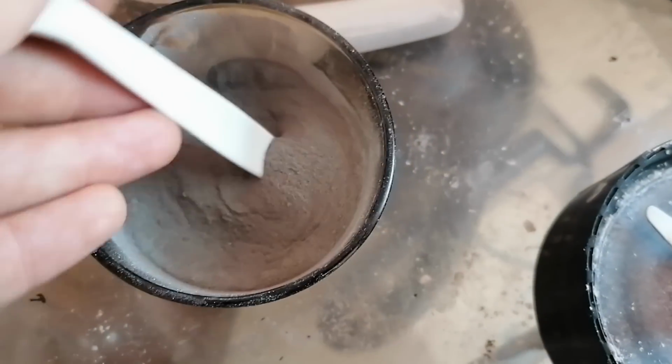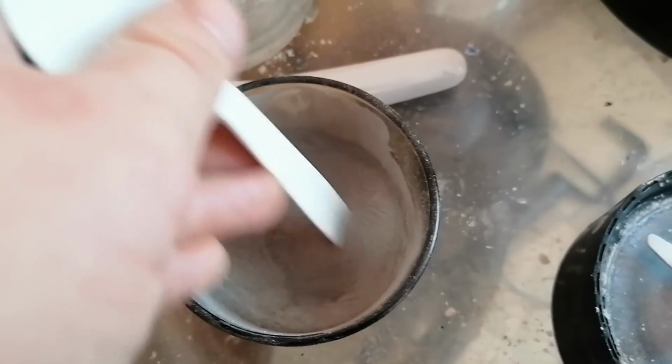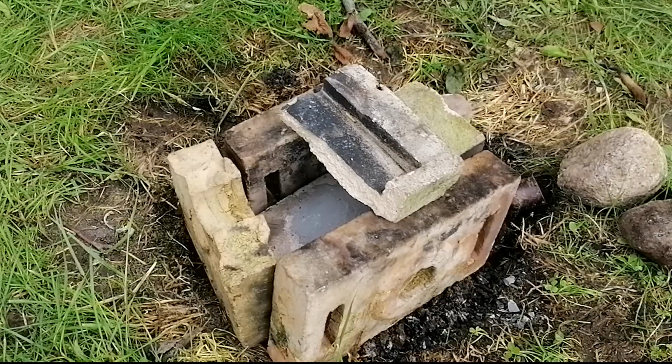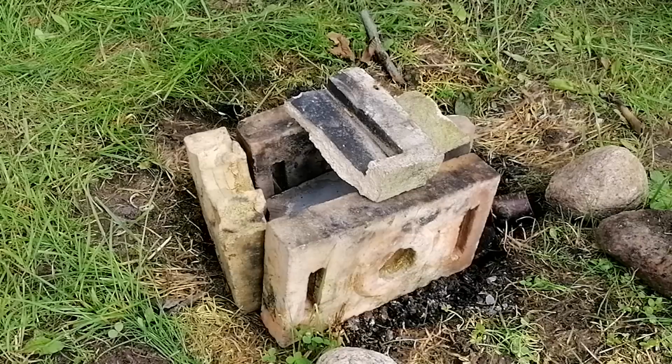Basically what we're doing here is a really exotic thermite. Compared to your usual iron oxide aluminum mix, it's quite similar. However, here the predominant metal is boron. So anyway, this is a little shrine which I built for the thermite to prevent boron metal from splashing everywhere. To light the mix, I'll be using magnesium ribbon. So fire in the hole.